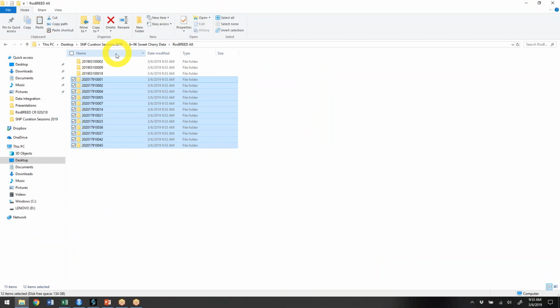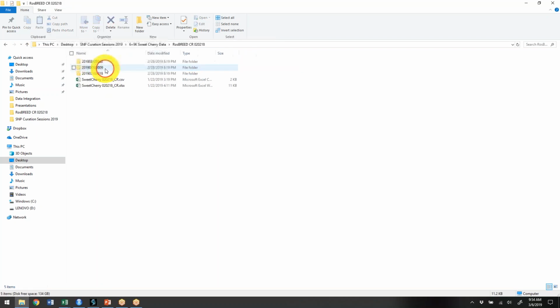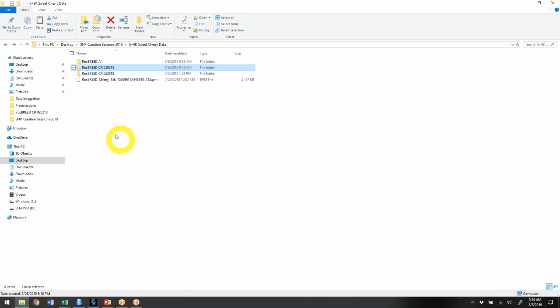The second thing that we need to do is then get everything into a single sample sheet file, because that's what will be loading into GenomeStudio. So for that, again, I start with the XLS version, and if I open that, that's the first one, and I need to get the data of the second file, of second folder too.